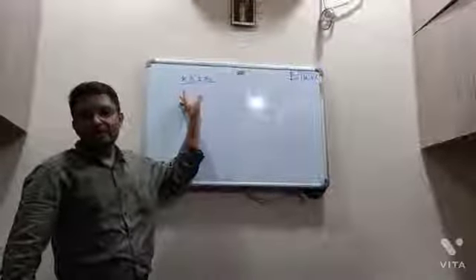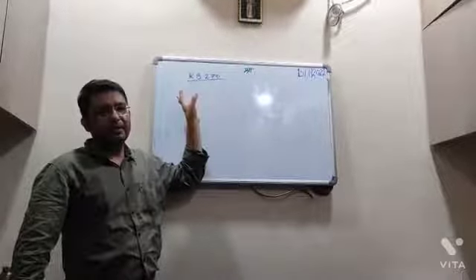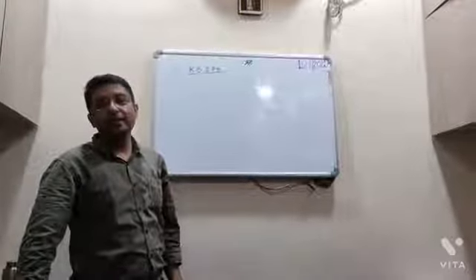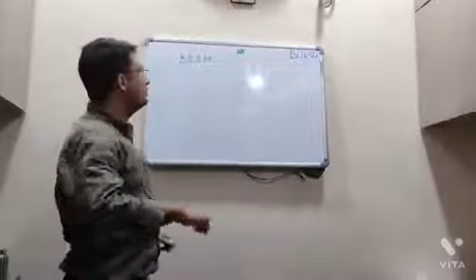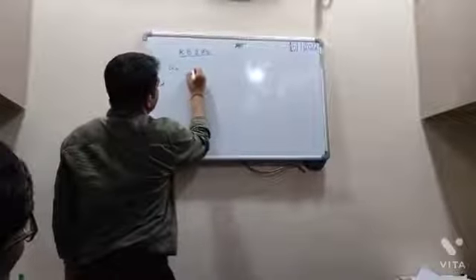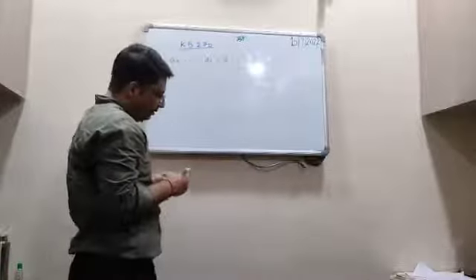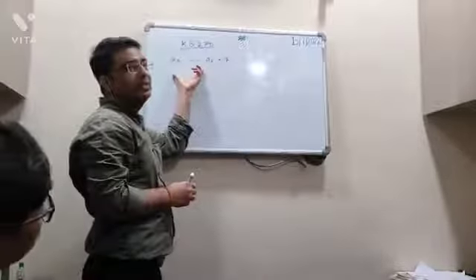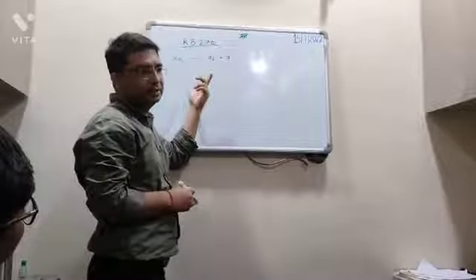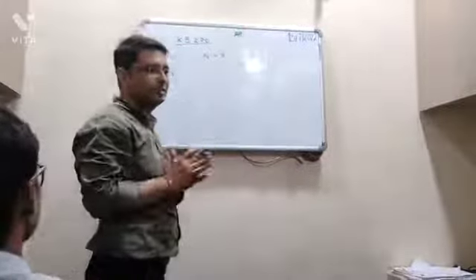So what we are going to discuss regarding KB-270, and in KB-270 what was our question? Regarding coefficients, right? So how many coefficients are here? It has A0 to A6. A6 means total 7. Now the question was from where these coefficients have come and how to use these coefficients. Right? This was the fundamental question which I have asked since the last 2 months.